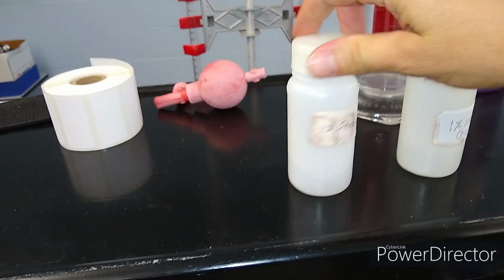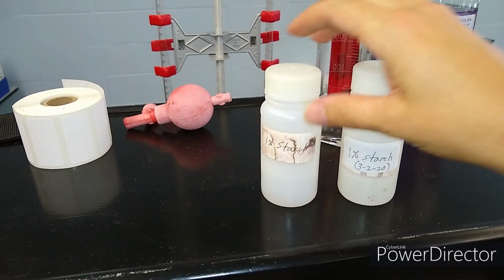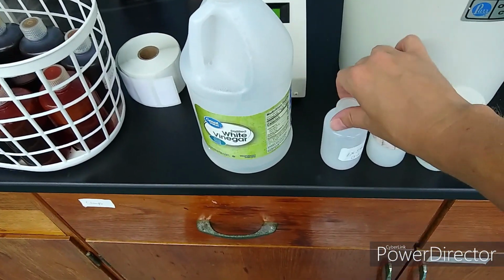And I got another bottle of it right here. I think this one was made at the same time, even though it doesn't have a date on it, which isn't good. I should always have a date on there, but it was probably made at the same time. Alright, so I found 3 bottles of starch solution altogether.